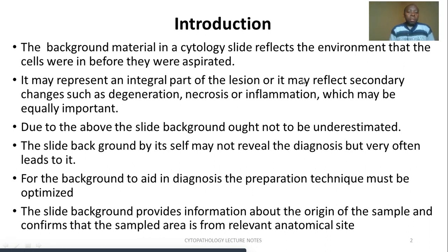So for the background to aid in diagnosis, we must know that the preparation technique must be very optimized. This is what I'm trying to say: we know very well that our results are always as good as our samples and how we process our different specimens in the laboratory.